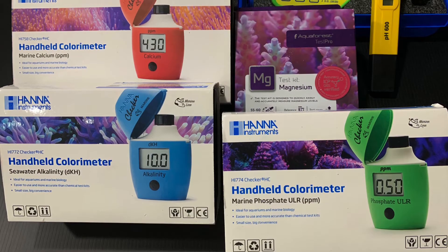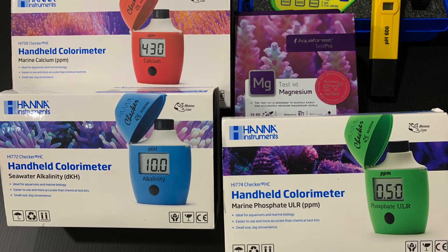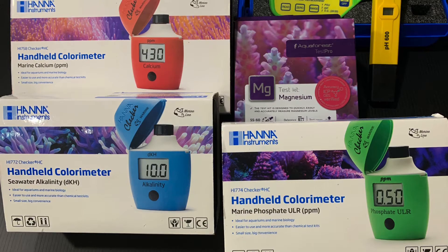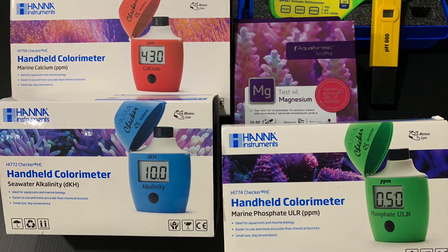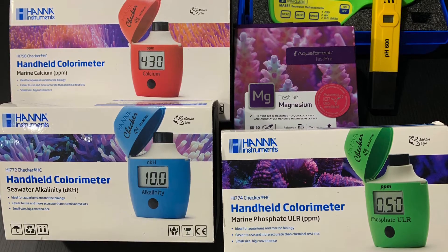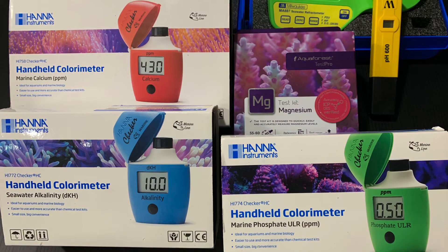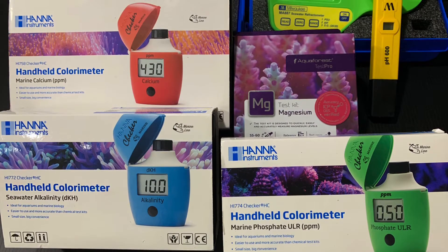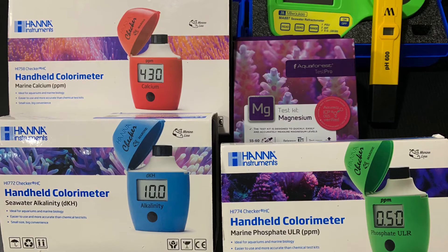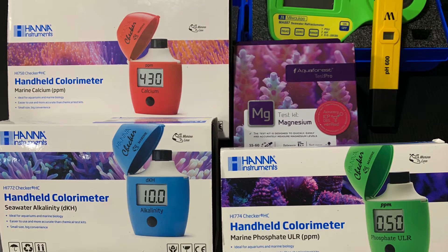The refractometer was terrible — first you have to find the perfect lighting, then you have to squint into the little scope to see the numbers, and then make sure it's focused. I ain't got time for that. When I first saw the Milwaukee salinity tester I told myself I was going to get it when I had enough bread. It's definitely not cheap, but it's absolutely worth the investment and it has not disappointed me since.